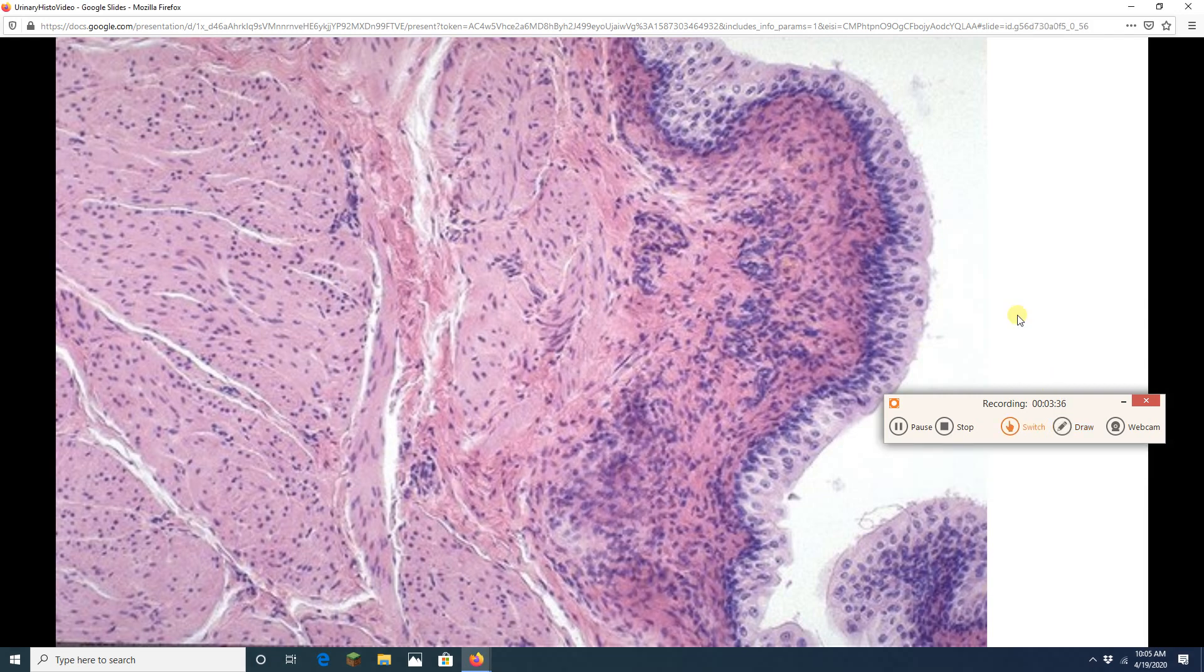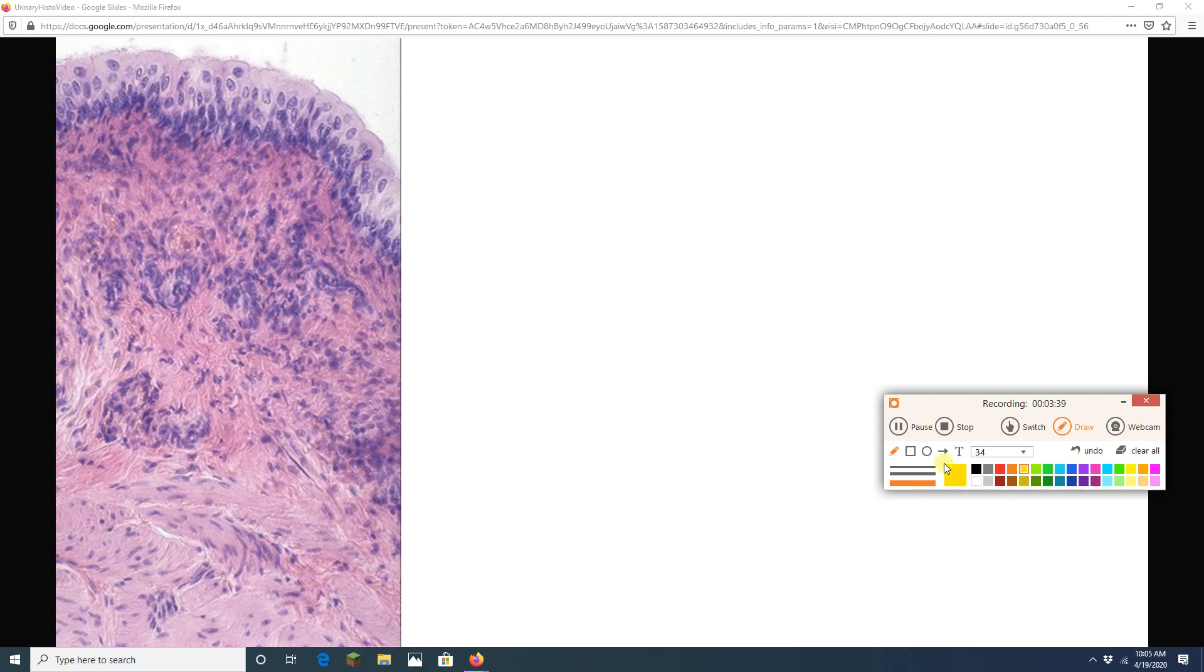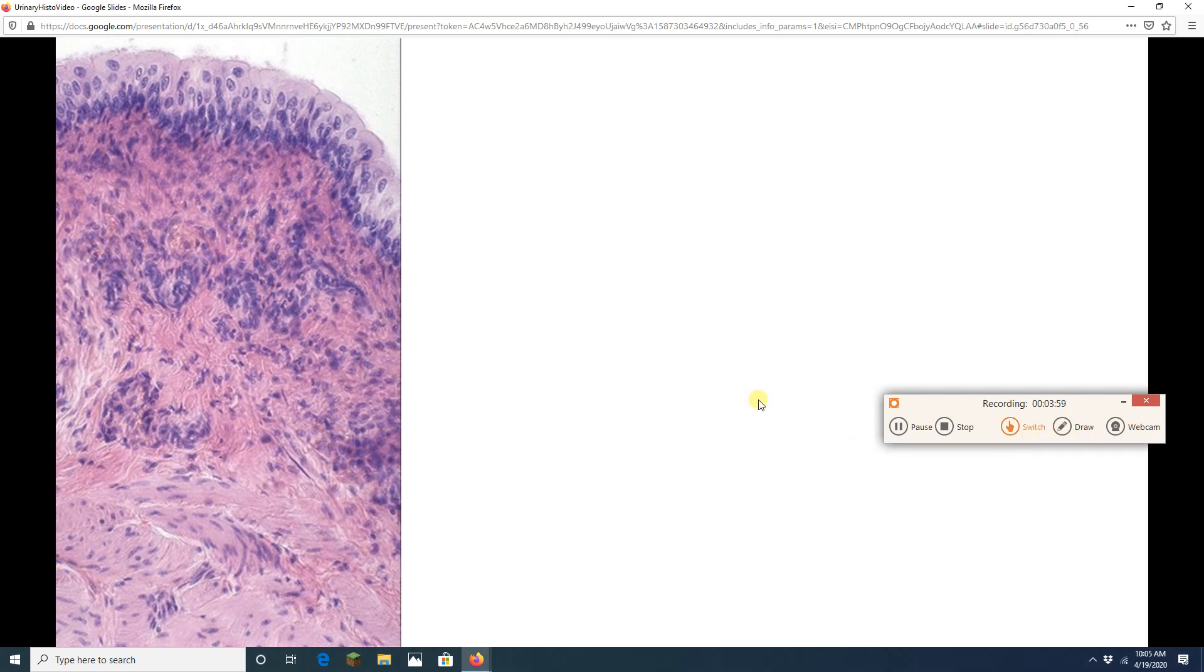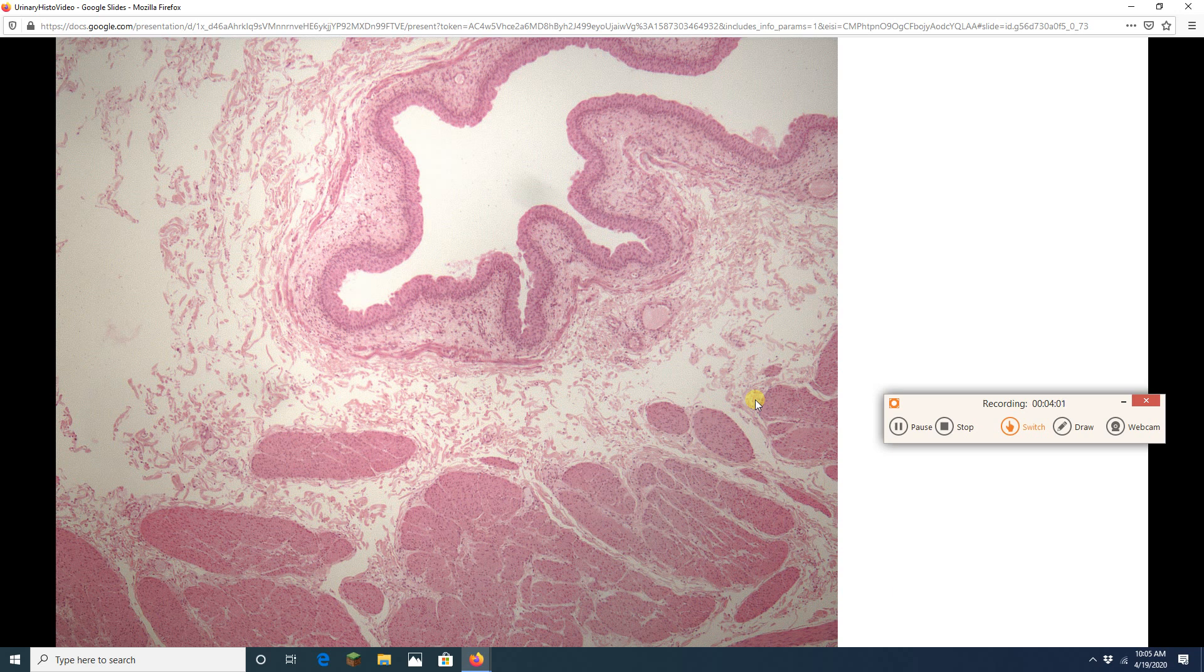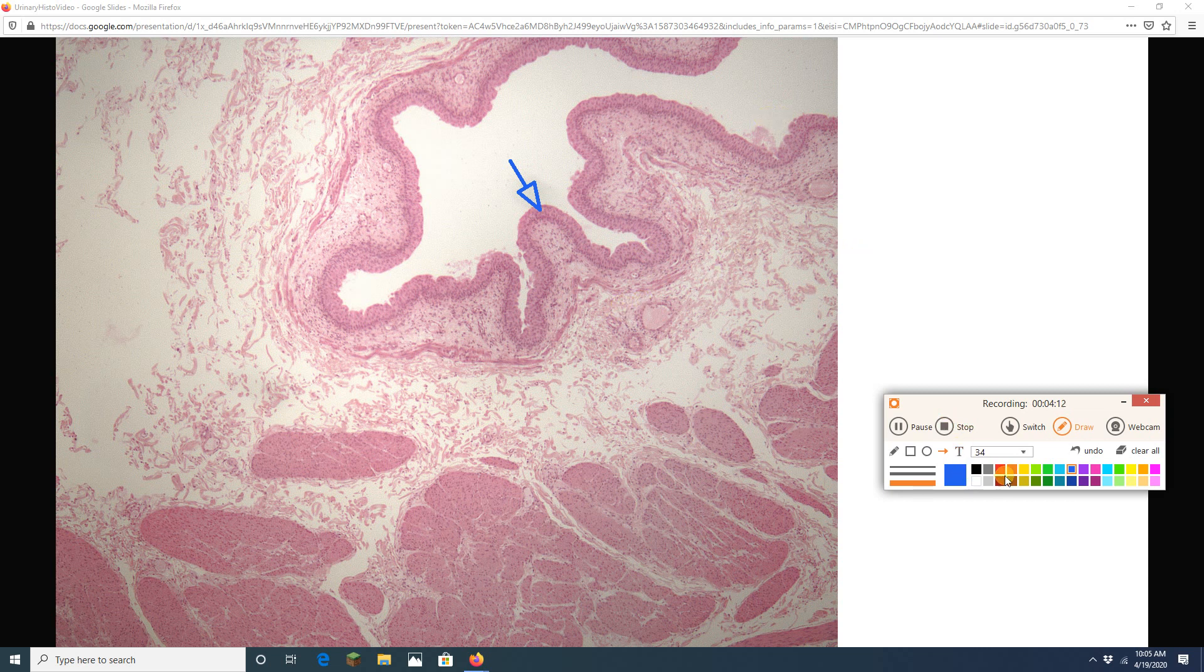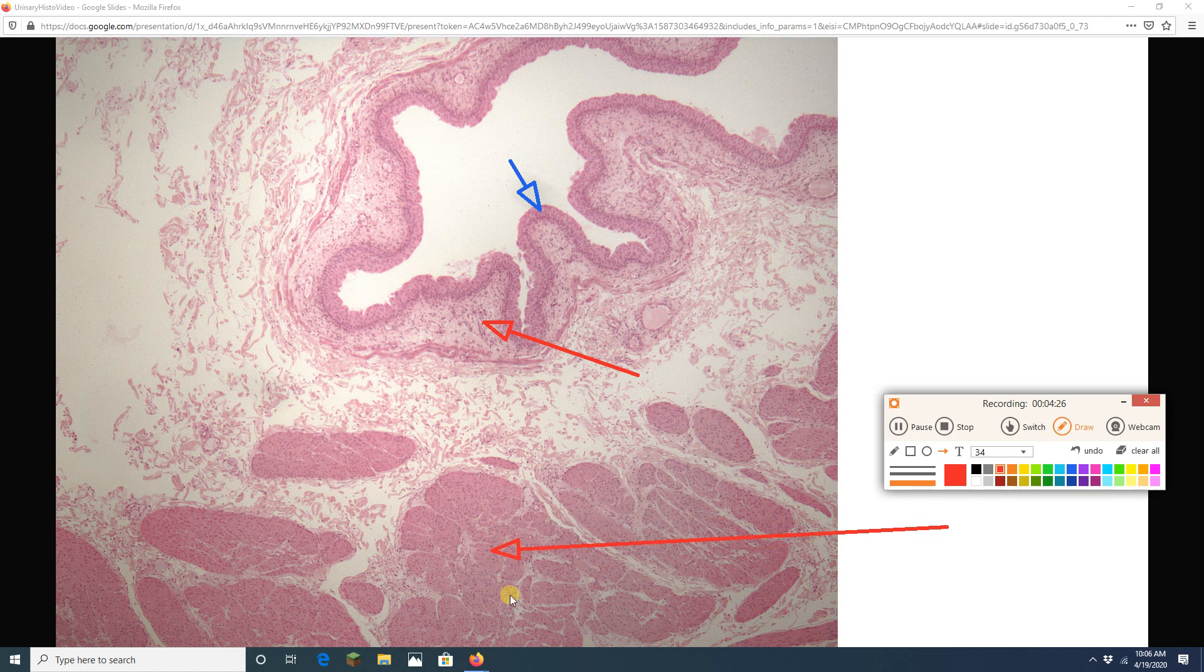And then we can see that transitional epithelium. Notice that transitional epithelium is of course a stratified epithelium. Now underneath it we are going to have this layer that is composed of connective tissue. It is the lamina propria. All this is detrusor muscle.